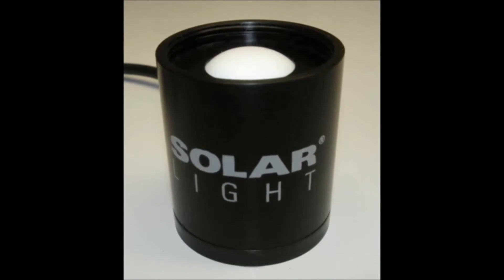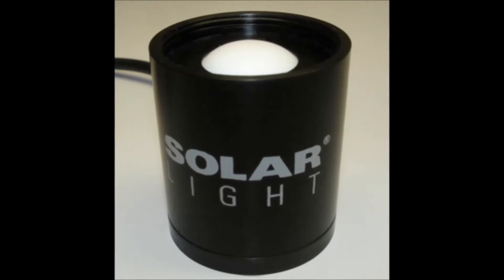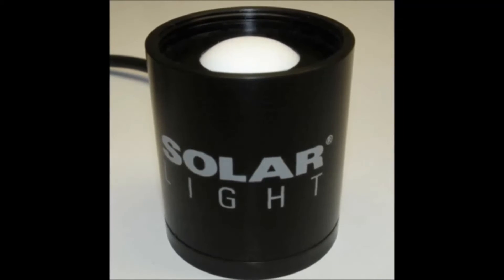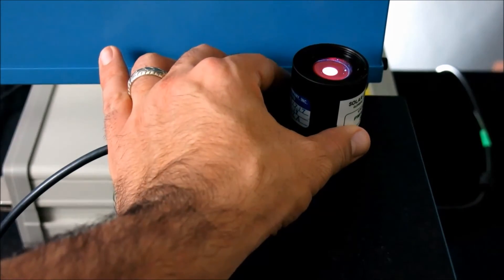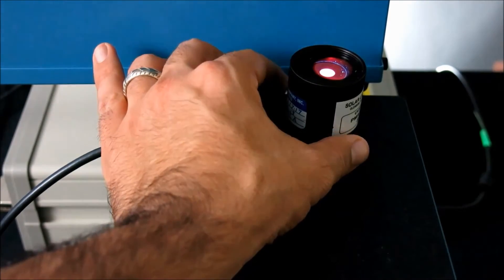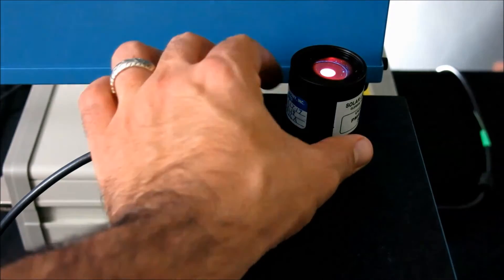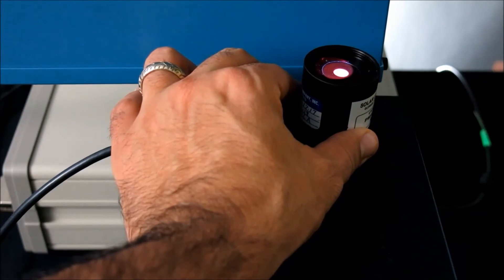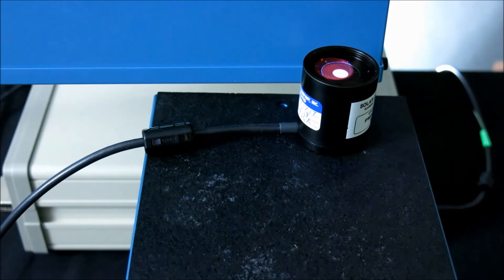The PMA-2107 UVA plus B sensor gives an accurate measurement of non-weighted UVA and UVB ultraviolet radiation from sunlight or artificial light sources. The sensor has an angular response very close to the ideal cosine function, making it suitable for measurements of diffuse radiation or radiation generated by extended sources. High dynamic range allows measurements of very weak signals, down to 0.001 mW per centimeter squared, as well as very strong irradiances up to 200 mW per centimeter squared.